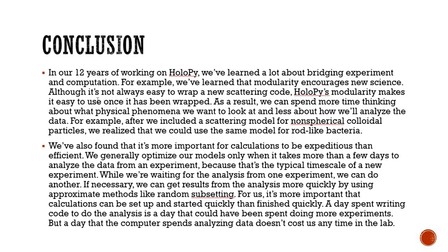As a result, we can spend more time thinking about the physical phenomena we want to look at, and less time on how to analyze the data. For example, if we want to include scattering from a non-spherical colloidal particle, we could use the same model for rod-like bacteria. As I told you, the holographic microscope is mostly used for analyzing bacteria or small samples which can move around the surface, and we can also find that the calculations are more important for the experiments than the efficiency.